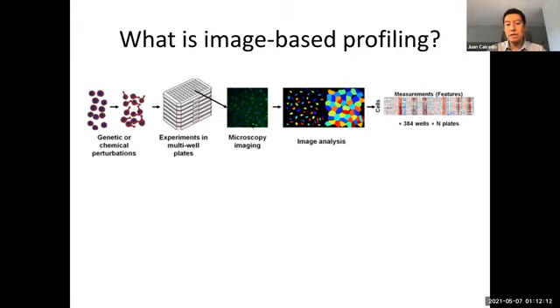And then you take pictures of the cells in order to capture the state after a certain time, after letting the compound or the genetic treatment make some effect on the cells, and you capture those images. And then the next step is the computational part, in which we take those pictures and we make analysis in order to extract quantitative information to estimate which treatments are working and which treatments are not.